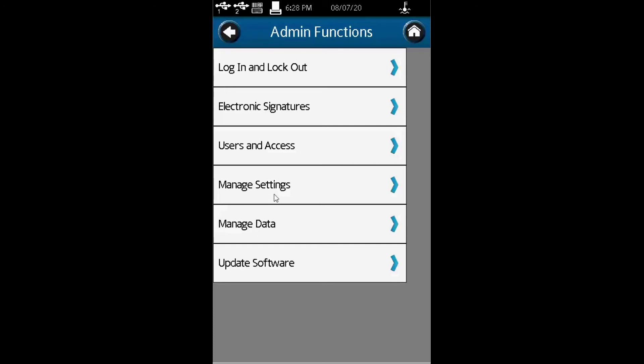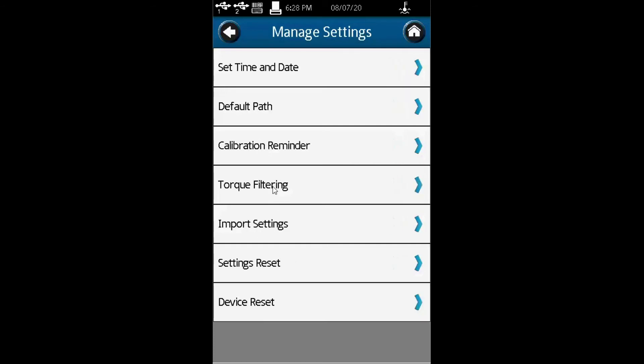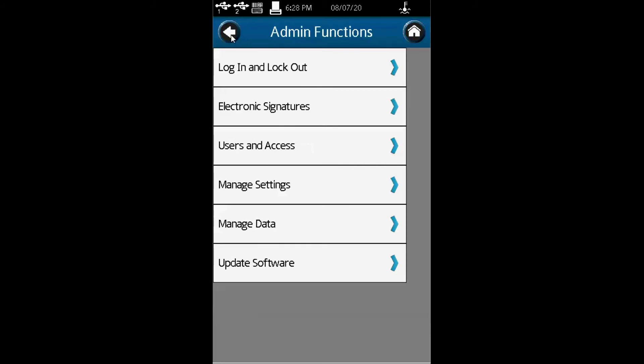Also, under manage settings, after user access, you can set time and date defaults, calibration reminders, and device reset.